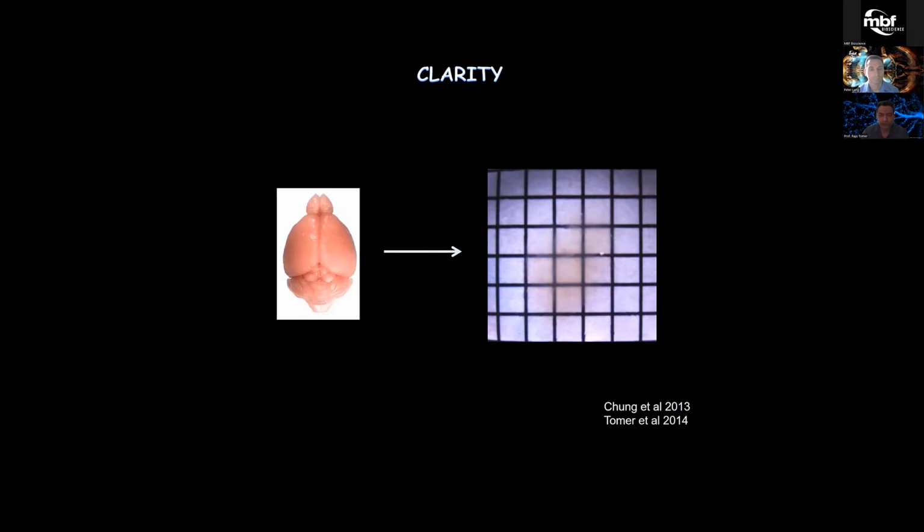So this new capability has also presented a lot of challenges when it comes to imaging these samples. If you want to image such a large sample at high resolution with conventional methods, let's say confocal point scanning, that's going to take a very long amount of time, weeks and months, especially if you want to do high resolution imaging.